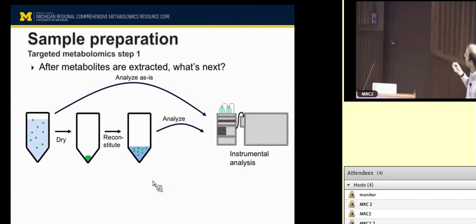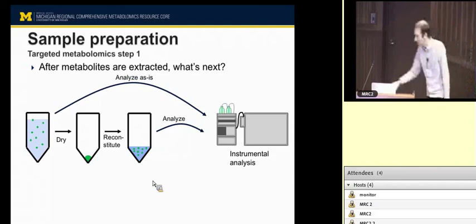There are going to be talks right after this one about what that entails, and a good way to do that. Prepare your samples, so that's getting things ready. And then we go through the metabolomics workflow, what we do here at the core, what you would have to do if you were running a metabolomics lab, and you get some data out of that. Usually you'll do some sort of statistics, you'll interpret it, and then that will inform, you'll either have your answer, you'll publish a paper and move on to another project, or that data will give you another idea and you'll move forward. So we're here, but really this workflow encompasses a lot of all of these steps.